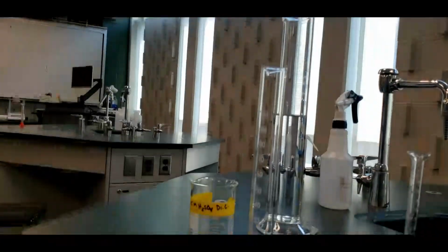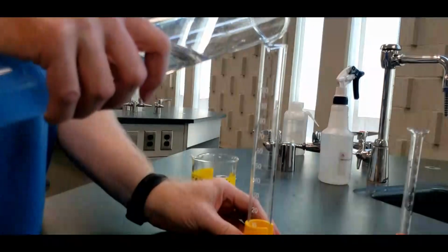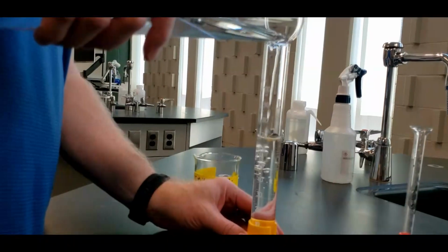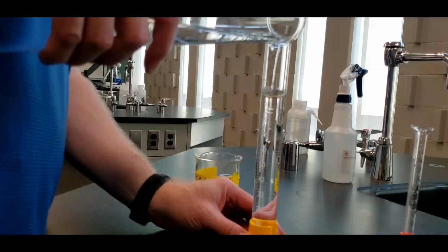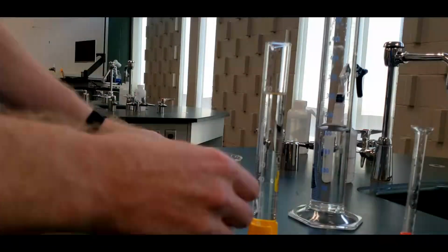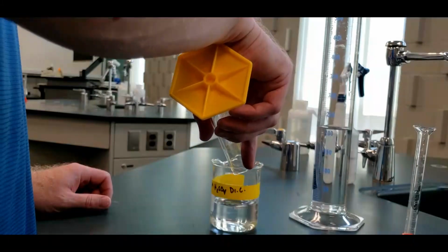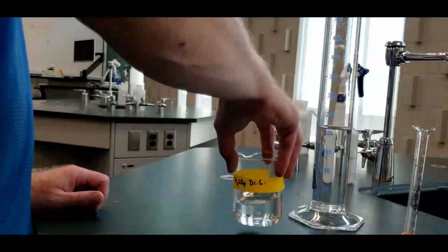Tilt it up a little bit here. There, okay. And then fill it up the rest of the way with distilled water. And for this one, again, we're going to get 0.15 molar sulfuric acid, but it doesn't have to be incredibly precise because this is for our practice runs. We want it to be very close to 0.15, but we're not going to sweat it if we're slightly off. Okay, but it's just to get us used to titrating. And then the KHP titrations, and then the unknown titrations we're going to do very, very carefully.